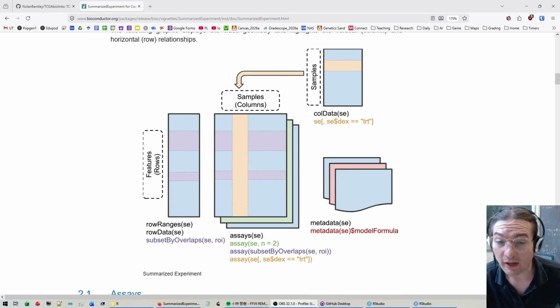In order to subset the clinical data, you can use code like this. This is going to operate how we've been showing in the past. However, here is where you're using logic to subset the columns, the columns being these columns, not these. That's the most confusing part. In other words, if you want to remove samples, you use your logic in the column section of the extraction.